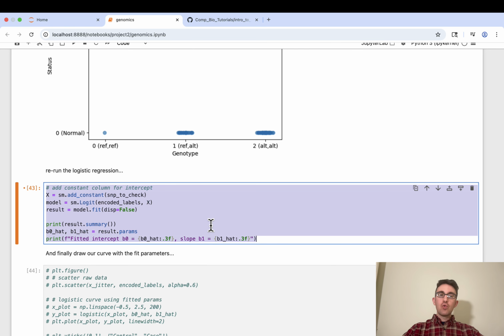These plots can be a way of exploring and visualizing the relationship of these particular SNPs that came up significant. You guys might want to try plugging in a couple more of them and just seeing what you get. It's just a couple more plots to help visualize things here, basically.